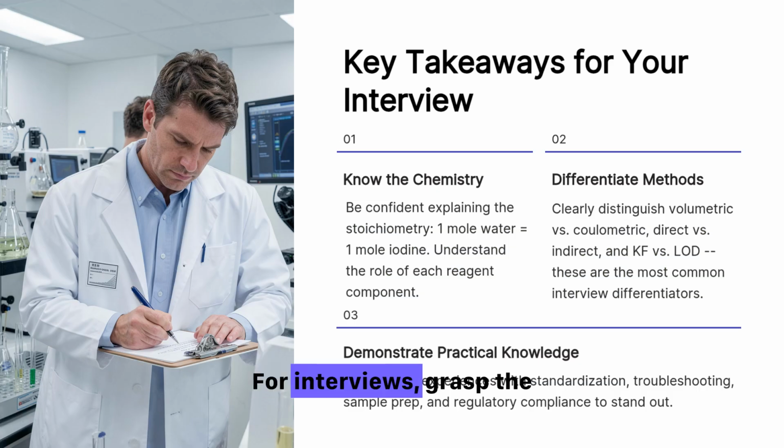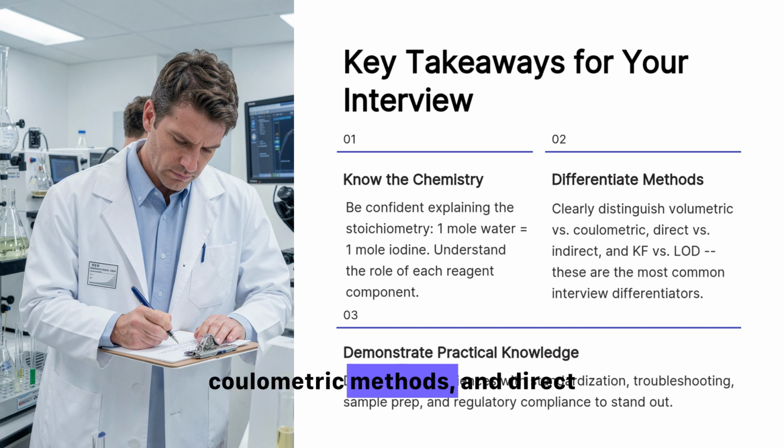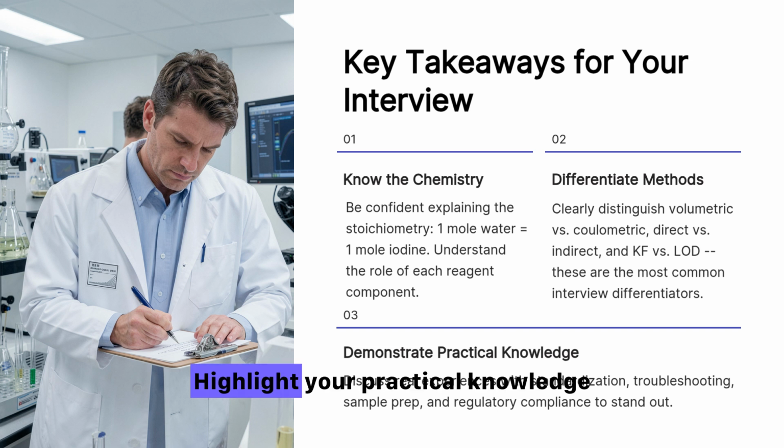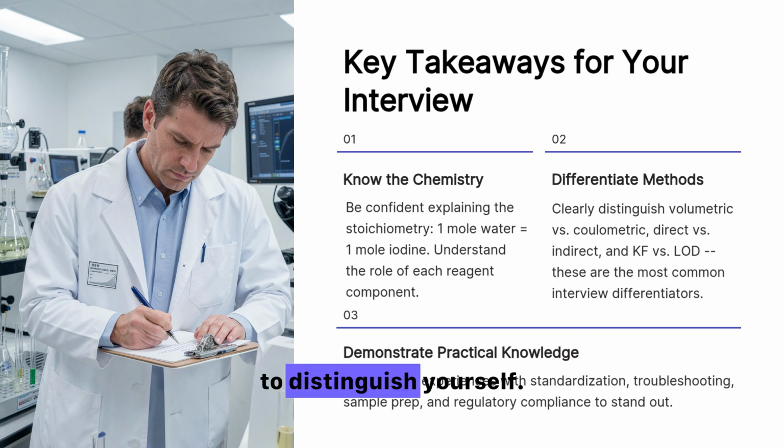For interviews, grasp the stoichiometry. 1 mole of water equals 1 mole of iodine. Differentiate between volumetric and coulometric methods and direct versus indirect approaches. Highlight your practical knowledge in standardization, troubleshooting, sample preparation, and regulatory compliance to distinguish yourself.